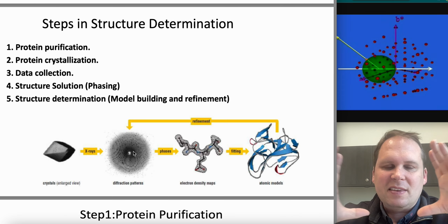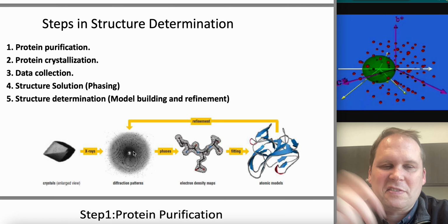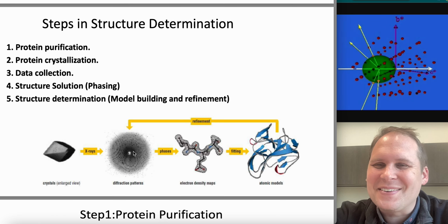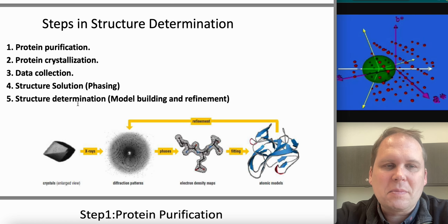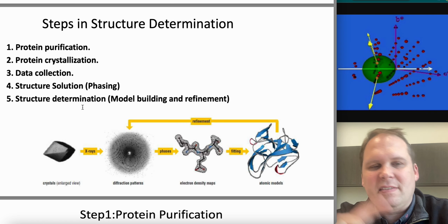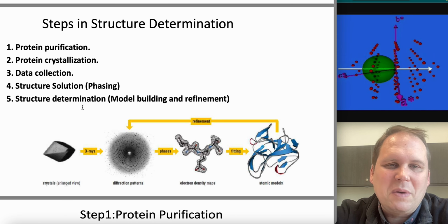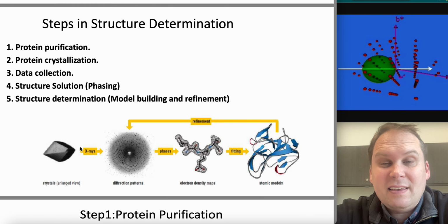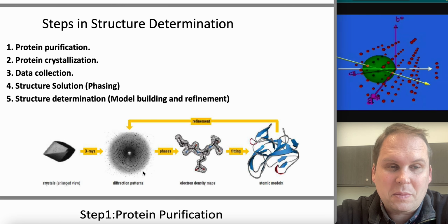If you imagine a two-dimensional plot, the phase, you can think of it kind of like the third dimension that's there. It's an additional dimension that you can't see, but that you totally need in order to understand what the heck is going on. And then once you have the phase, you're going to do structure determination, which means basically finding a structure model that will fit the available data that you have and still obey the way proteins fold to some extent. And so most things that diffract and where you can phase it, you can almost always solve those.